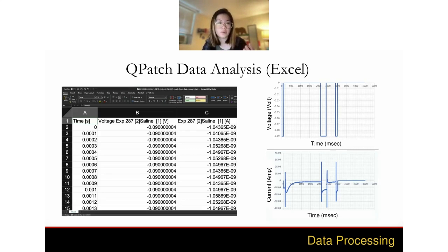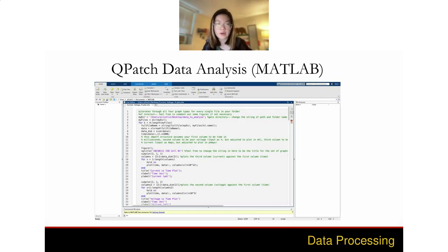So we wanted to run slightly more sophisticated analysis because we were able to generate so much data in such a short period of time. So while we were at Neuropracticum, that same first day when we started using the machine, that night, Audit and I wrote up some code in MATLAB because it's a coding language that's pretty familiar to both of us. And we wanted to be able to iterate through the 15 different Excel files that were generated from that day of recording, which is a very large amount of data compared to how much data you'd normally get in a single day of electrophysiology.